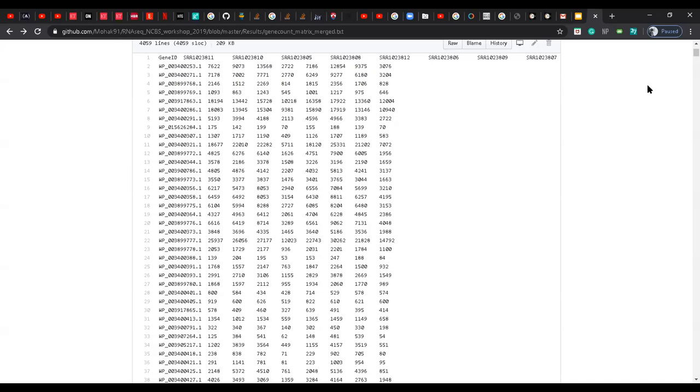That would then help you to align your reads against a given reference genome, and you generated something called a SAM file, which is the sequence alignment map, which gives you the leftmost coordinate of all your reads that would have mapped to the reference genome. And then that SAM file is your go-to file for whatever analysis you are going to do downstream of it. And then we did a couple of file format conversions. We converted the SAM into BAM, which is just the binary form of SAM. We sorted it, indexed it, and then we saw how many reads mapped.